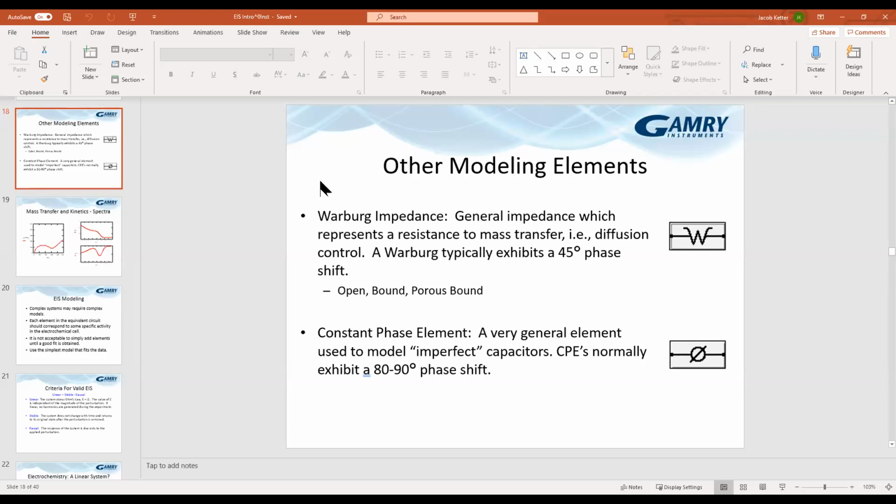So if you have the working sense electrodes connected to your working electrode on a powered system, and you have your counter and your reference on the generally negative terminal of that system, and if your black lead comes into contact with that counter electrode, then that will basically, because that black lead is at about the same point energetically as the working lead, effectively short the battery through the system. That will cause damage. If you're working with powered systems in general, you want to take care not to short things through it most of the time.